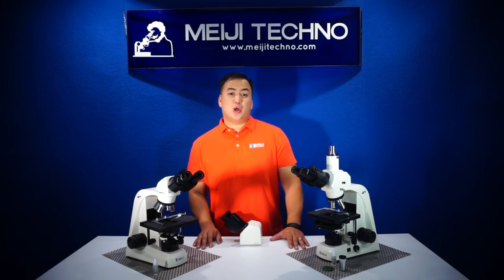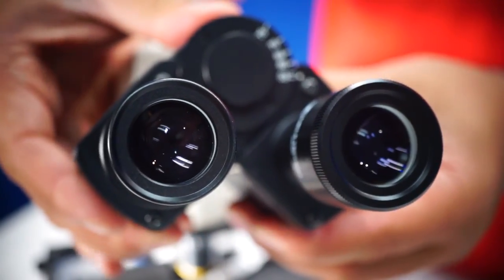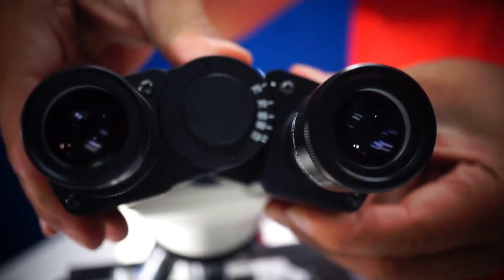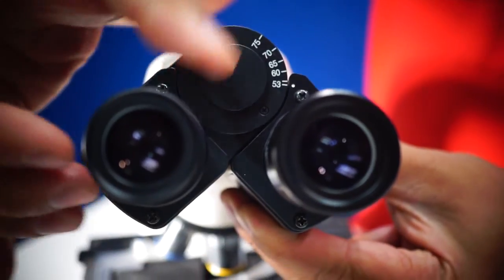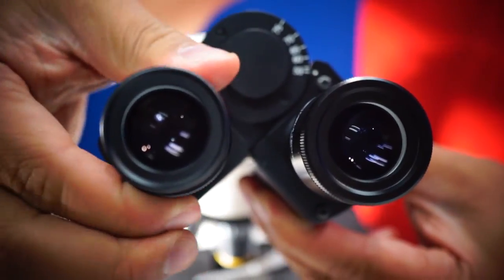The MT4000 also includes a pair of 10X eyepieces, high eye point at 23.2 millimeters in diameter, available on a comfortable side-on-top binocular head design, or trinocular head design, and it's inclined at 30 degrees.